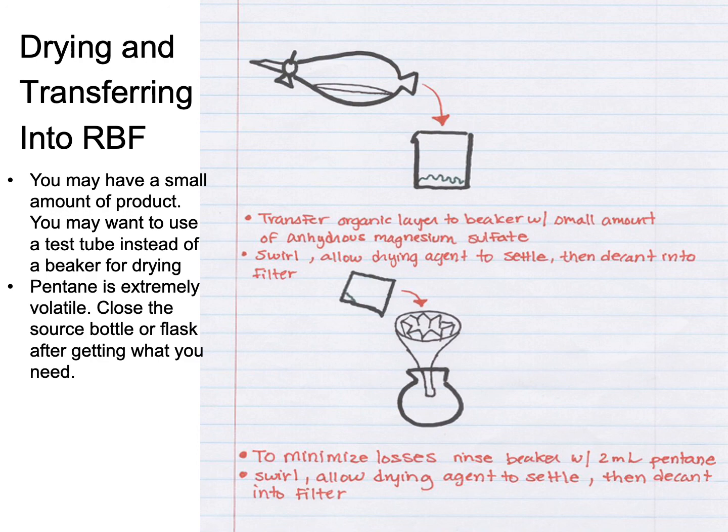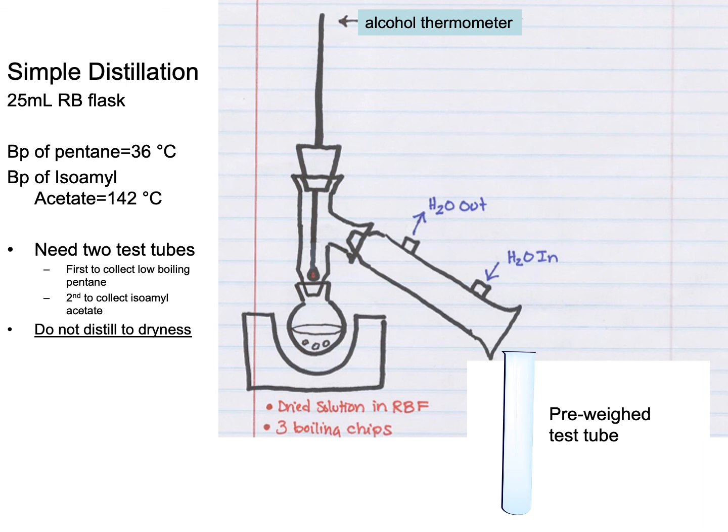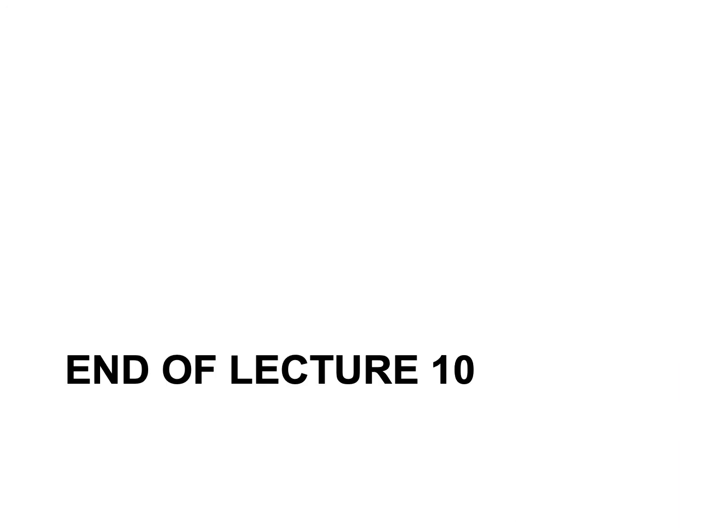In the next step, as you see, with the use of distillation, the simple distillation, we are going to obtain pure ester. And that was the whole process for esterification. Thank you for considering this video.